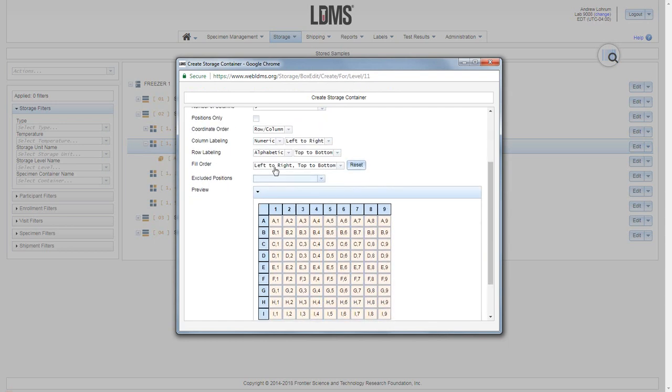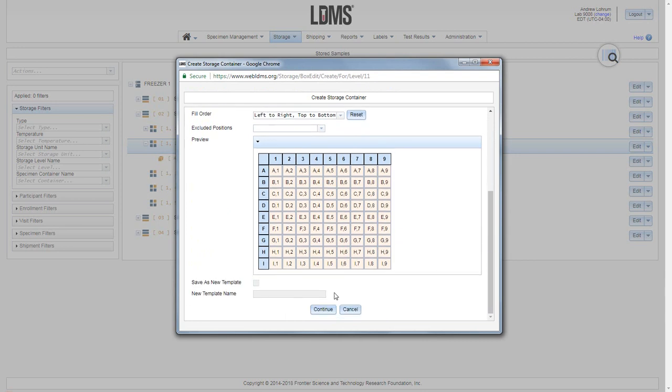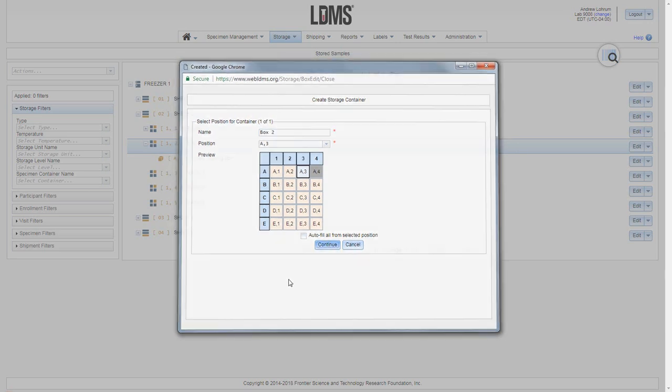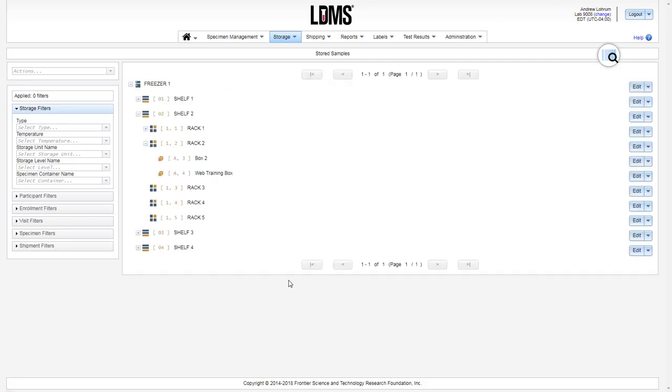Everything will be pre-filled for you. Click continue and assign the box a position on the rack. Give it a name and click continue to give it that position.